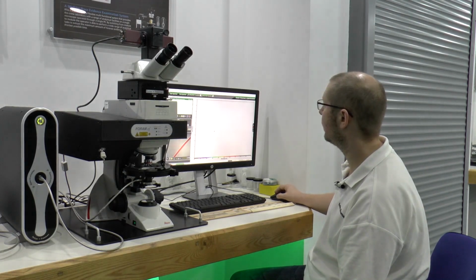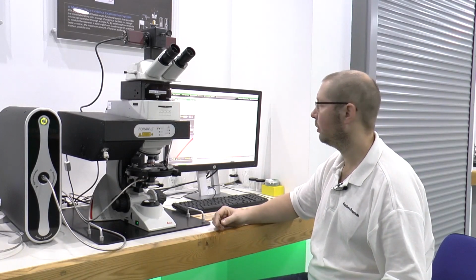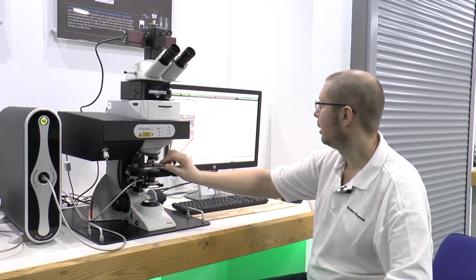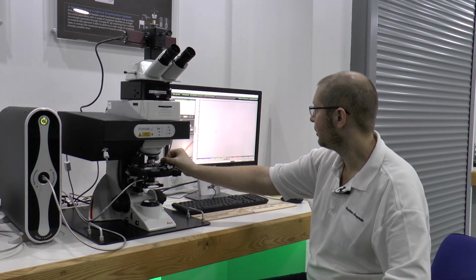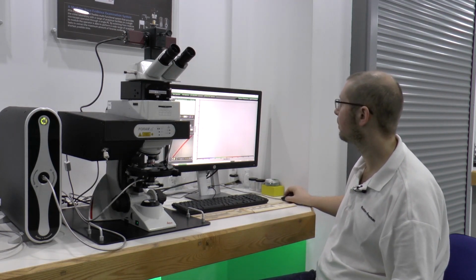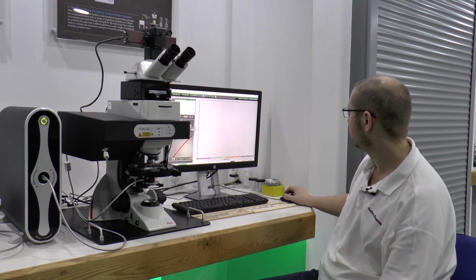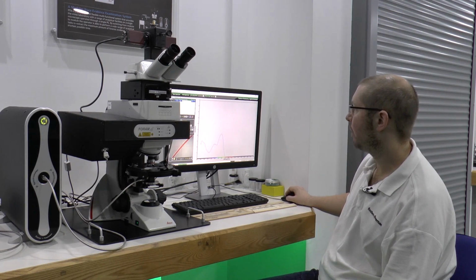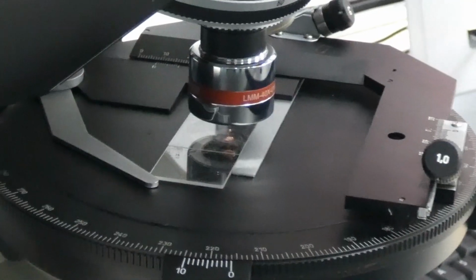Okay, once it's done, we click OK, and now we need to record a dark reference. Once the white reference and dark reference have completed, we just now need to position our fibre under the crosshairs as indicated on the live video feed. Make sure that the fibre is in focus, and we can record our spectrum. It will use the same parameters that it took from the white reference to then record the absorption spectra of our red fibre.